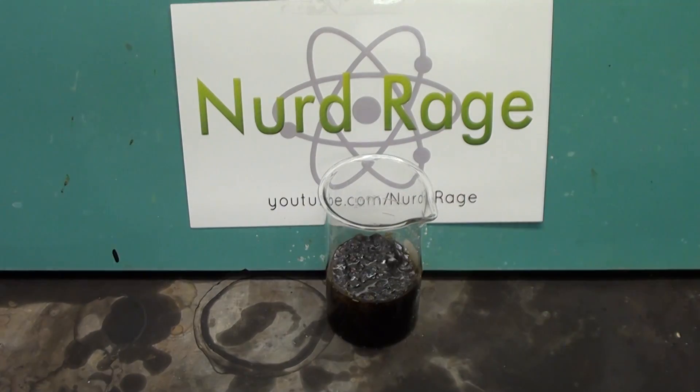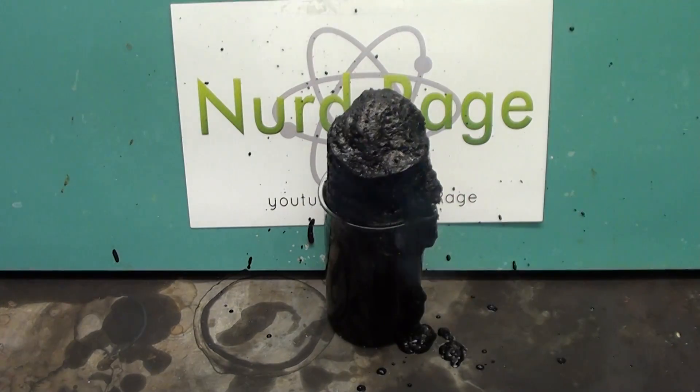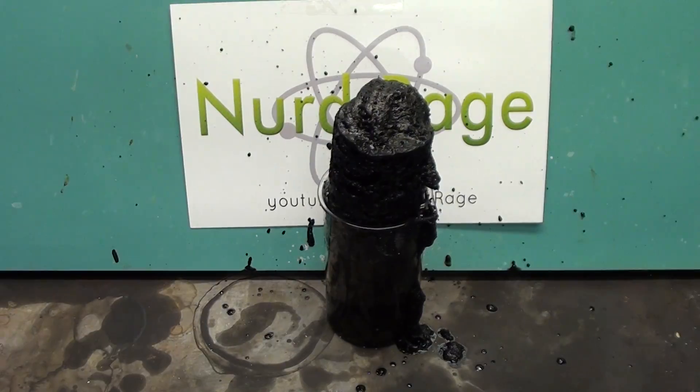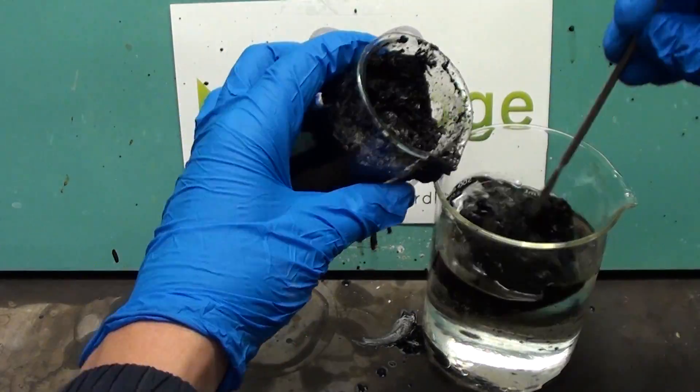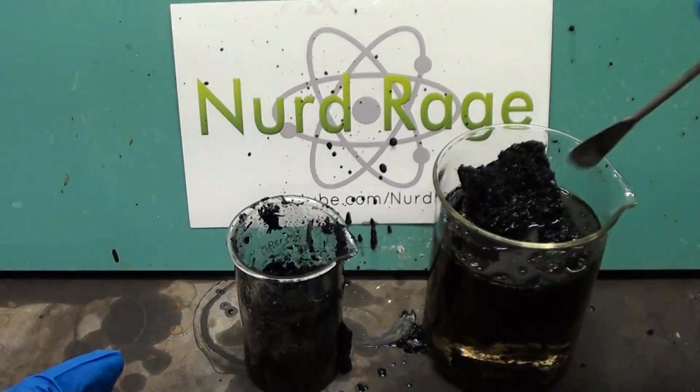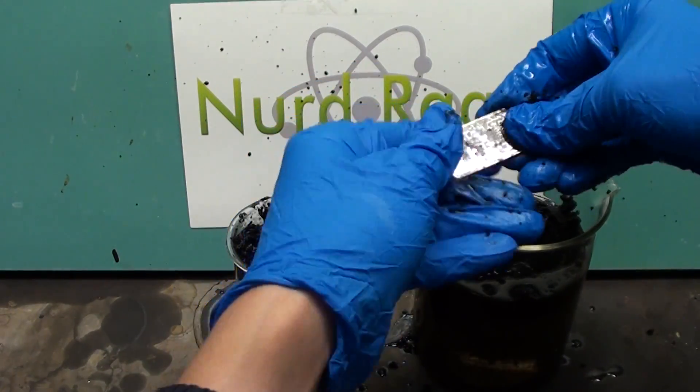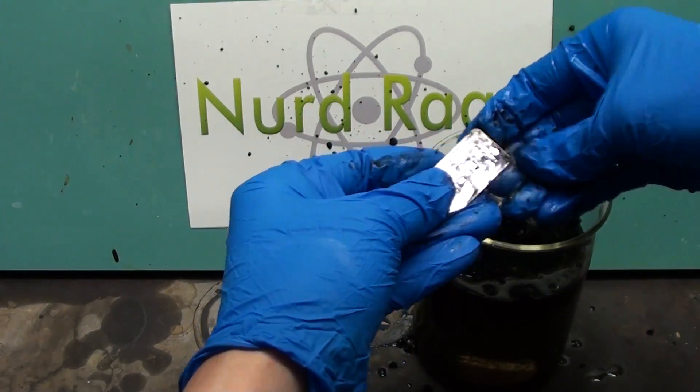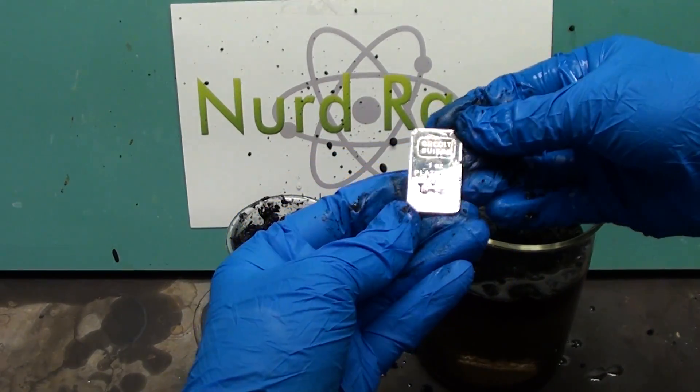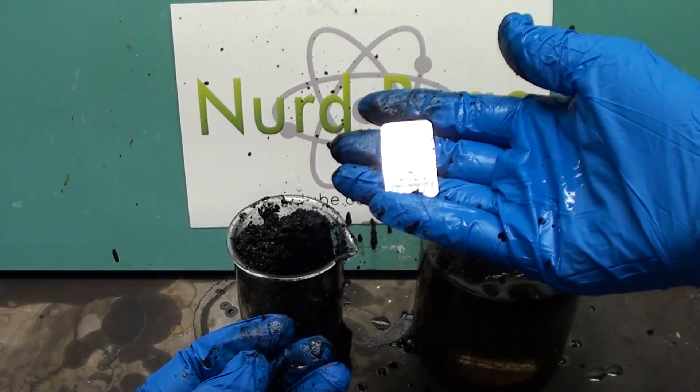The sulfuric acid is removing water from the sugar and leaving behind carbon. Now the platinum bar is embedded in this pillar of carbon, so let me retrieve it. And there it is. I think I scratched it when I jabbed it with my spatula. Oh well, the sulfuric acid itself did not damage the platinum.